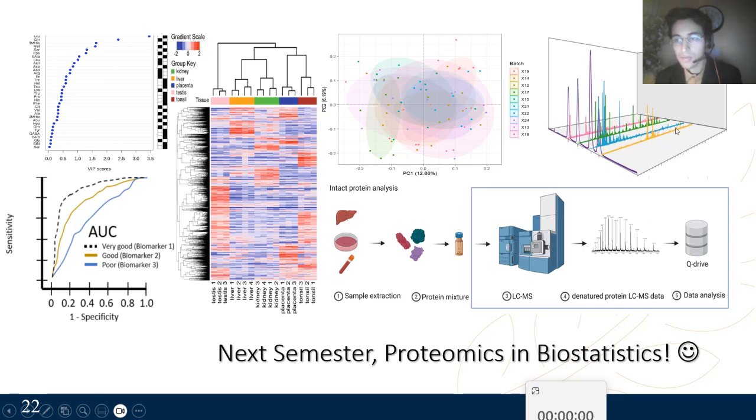These are all ion counts for each mass over charge, and each of these is like a frame. It adds frame after frame after frame until it gives you all of this huge peak right here. That's why we said in the first slide that we look at the mass spectrometer as a detector, because this whole thing is just the addition of all these small fragmentation patterns or mass spectra. So it's a very powerful tool. There are a lot of things you can do with it. The amount of data that you get from it is very powerful.